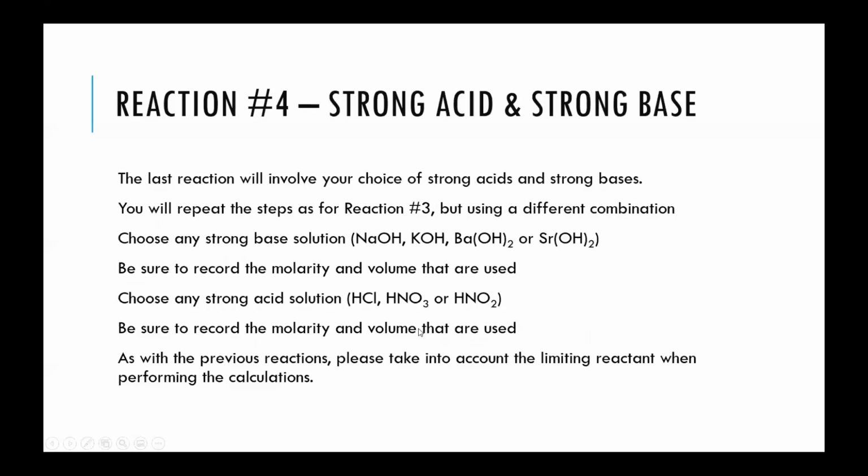The fourth reaction is kind of a repeat of the third one. In that one, you particularly looked at sodium hydroxide and hydrochloric acid. In the fourth reaction, you're choosing any of the strong bases to react with any of the strong acids.